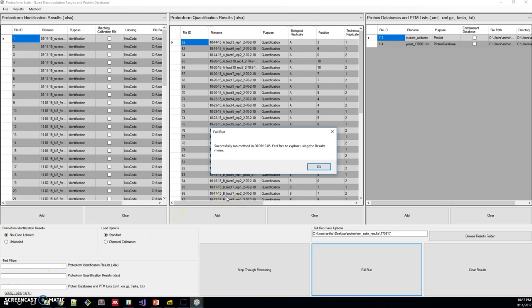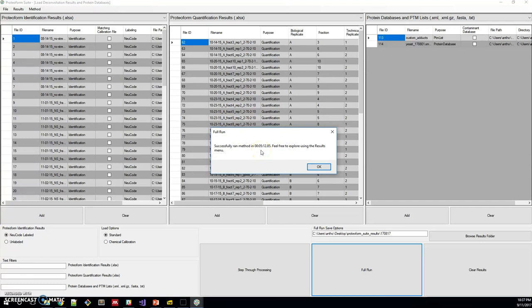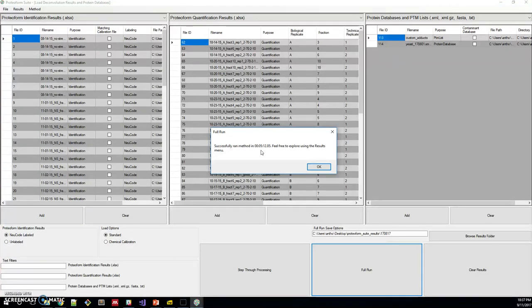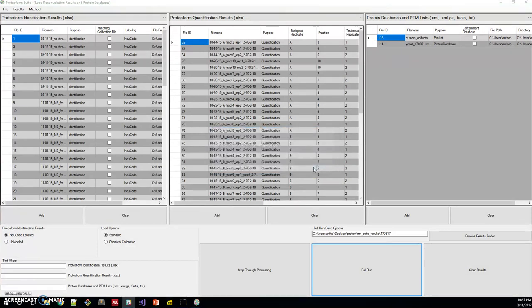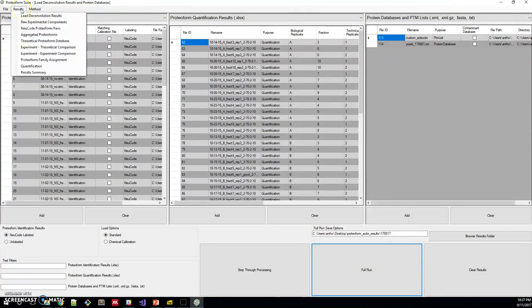After the full run, you'll see this pop-up and it'll tell you that it ran successfully. In this case, it took about five minutes. This is an 8-core machine, so it might take more or less depending on what type of machine you have. We'll click OK and we can look through the results menu to see what the results of this analysis are.